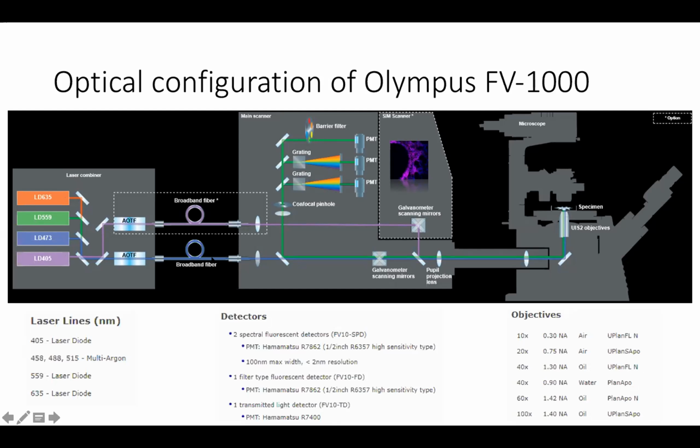It's going to pass through the fiber optic cables, through the mirrors, and this is where the magic of point scanning happens, right? So we have got galvanometer scanning mirrors. What that means is, in contrast to epifluorescence, where you have a big bulk of light exciting the entire area, you have a laser point source, which is going to be smaller than the bulk of light coming through epifluorescence. So, how do you scan the point source of the laser onto different areas of your specimen?